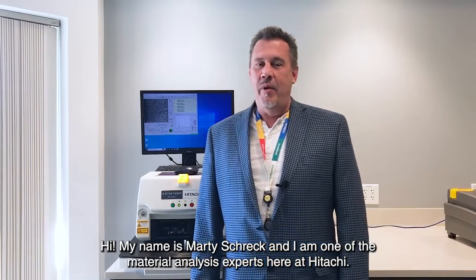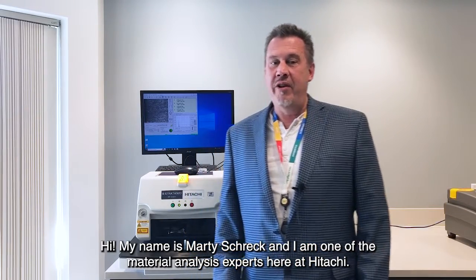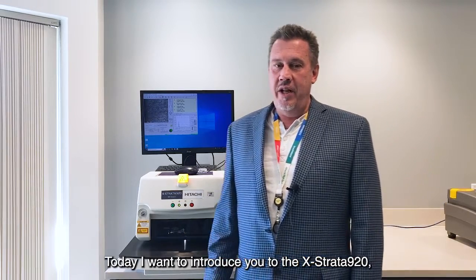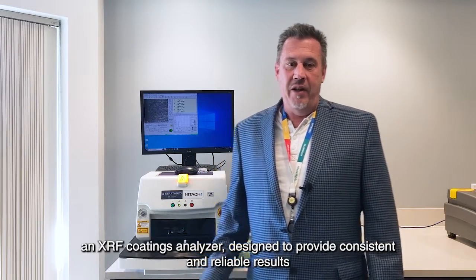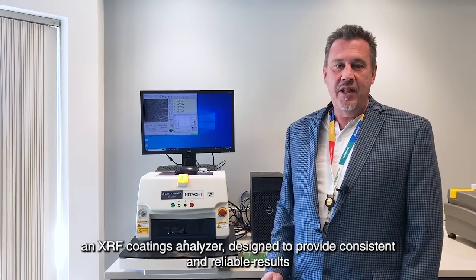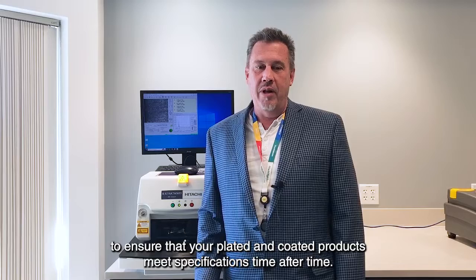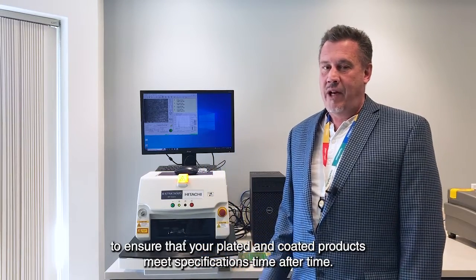Hi, my name is Marty Schreck and I'm one of the material analysis experts here at Hitachi. Today I want to introduce you to the X-Strata920, an XRF Coatings Analyzer, designed to provide consistent and reliable results to ensure that your plated and coated products meet specifications time after time.